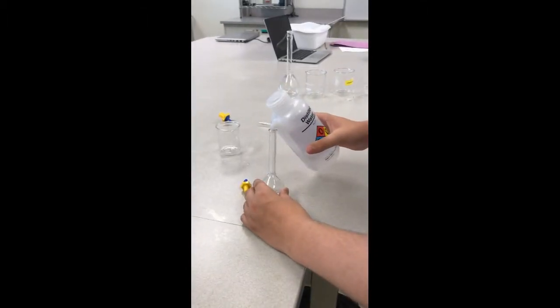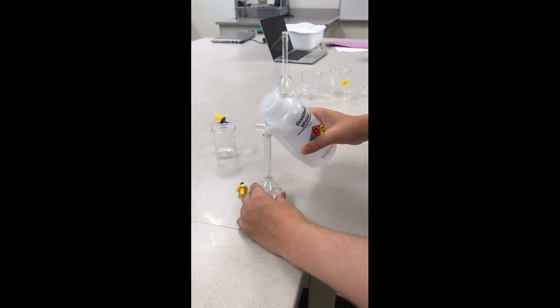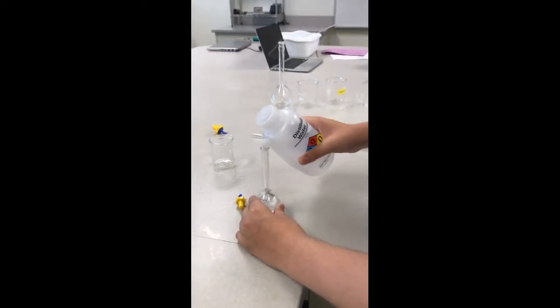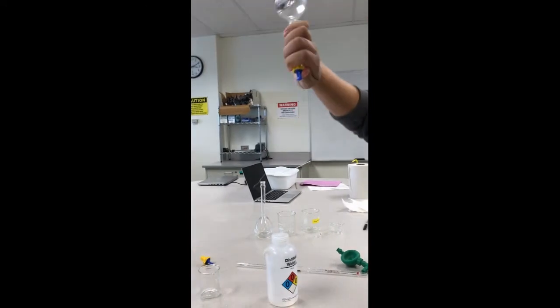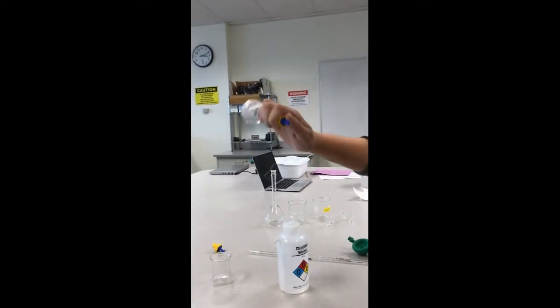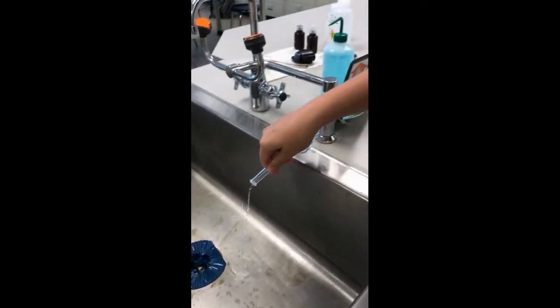To clean out volumetric flasks, fill them with DI water. Don't go too fast or you may splash it all over the place. I wouldn't know from personal experience. Invert the flask to clean out everything. When you think you've inverted it enough, take the stopper off and pour it down the drain.